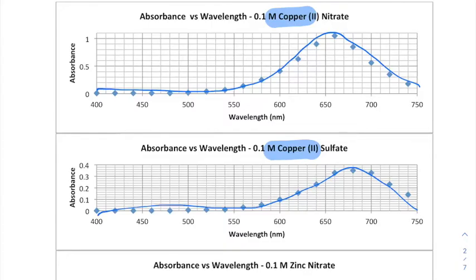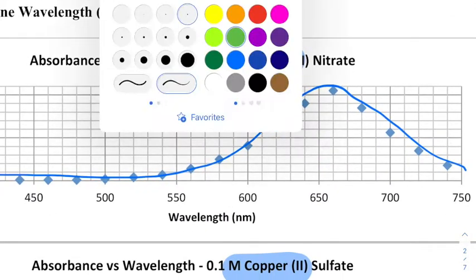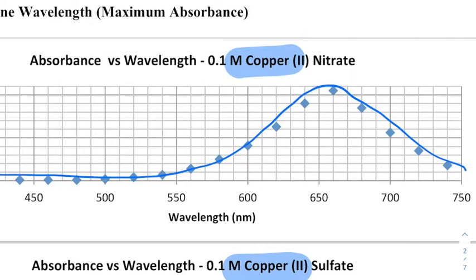So now what we're going to do is do a Beer's Law analysis of our solution. Remember that our colorimeters have only 3 options for our collection of data. We have a blue light at about 470 or so. That doesn't look very good. We've got a green light at about 565. Maybe okay. Or we've got a red light at about 635. Yep, that's the one that we're going to need. So again, we're going to use our red setting at 635 nanometers in order to collect this data.